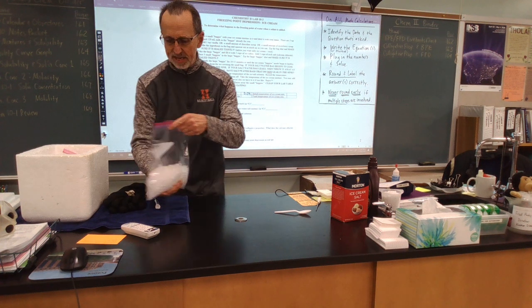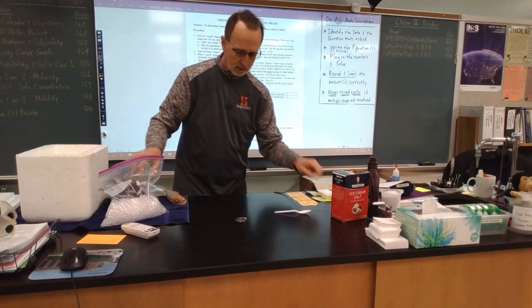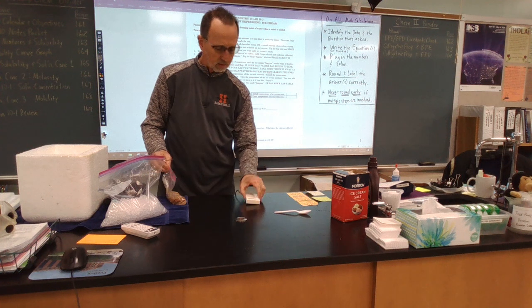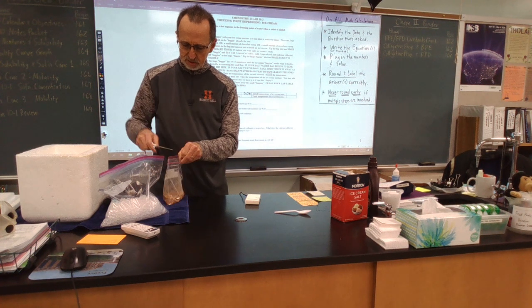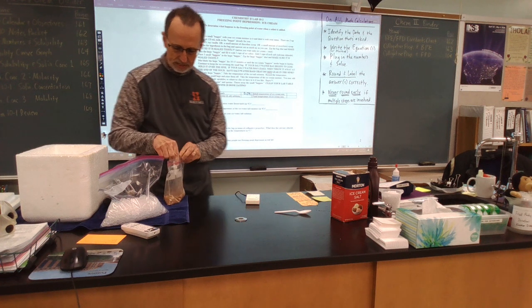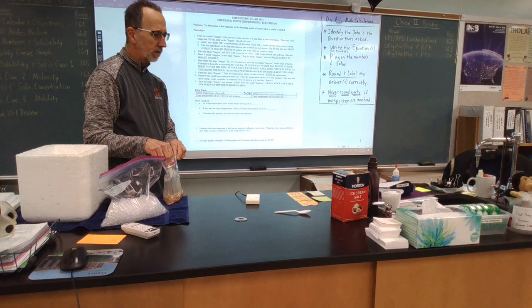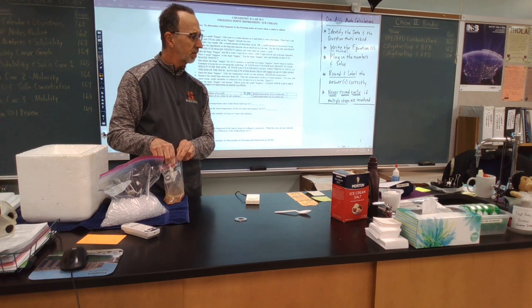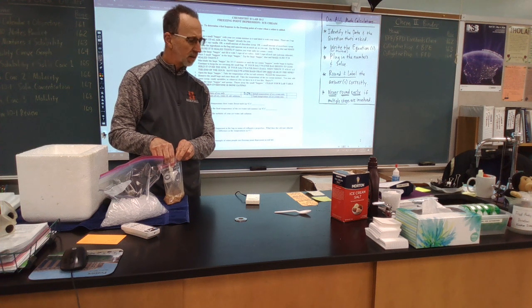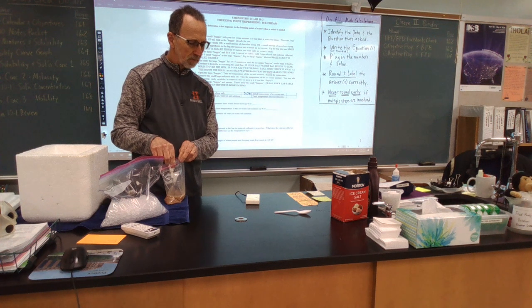We also need, I may as well do that now, take the initial temperature of the ice cream mixture before we freeze it. So I'll do that real quick. Just open this back up. Put that in there. See what we get here. Of course, it's not frozen, so it's definitely going to be above 0 Celsius.